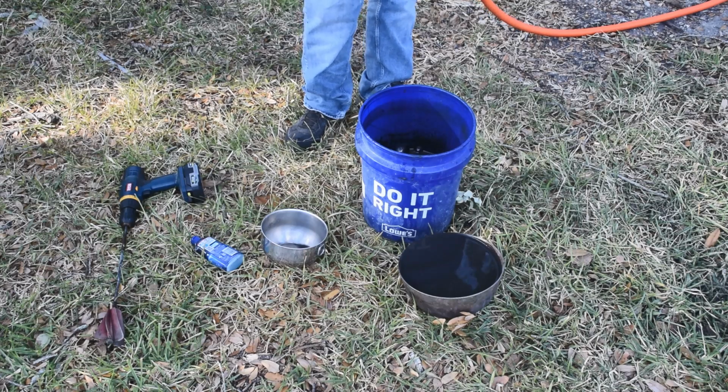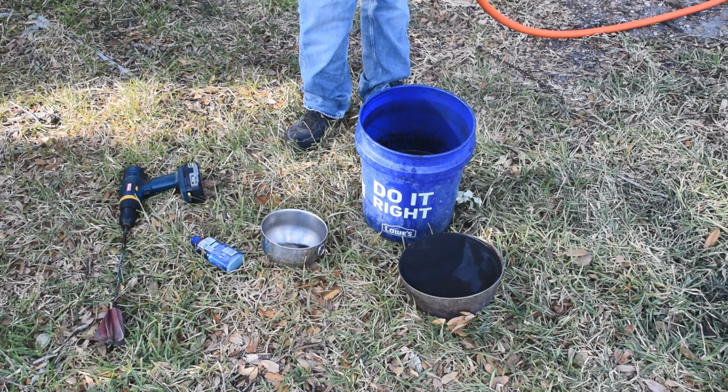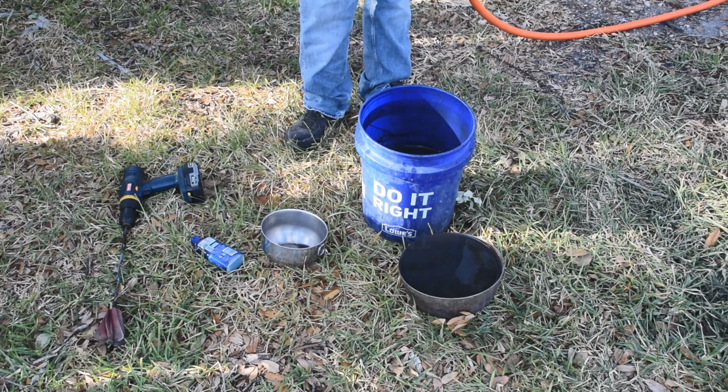You might be asking yourself, why am I going to all this trouble? Why don't I just treat all of the solids in here? Well, there's too much material here for any of my beakers. I could divide it up amongst multiple beakers, but still there's a lot of material here and only so much space in my fume hood and only so many hot plates. So I'm going to do it this way. Another problem is all this fine ashy stuff is going to plug my filters. So I'm going to try and get rid of as much of the really fine ashy stuff as I can, hopefully without getting rid of any of the silver.